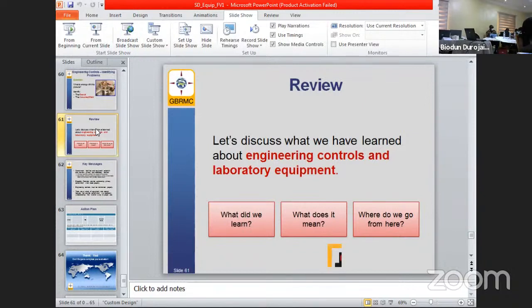We have just looked at this in engineering control, and we considered basically the BSC, the centrifuge, but there are other equipment in the laboratory that people use too. Like which one? Now, what about the incubator? I think we should also look at those capabilities and how they could go wrong. So, not to limit it to the biosafety cabinet and centrifuge. We have a hotplate, an incubator, a water bath in the laboratory. Exactly. Even if they are not for primary containment, they are also important, every equipment that you use. And that is where your good laboratory practice also comes in. It's an extension. So you look at every equipment.